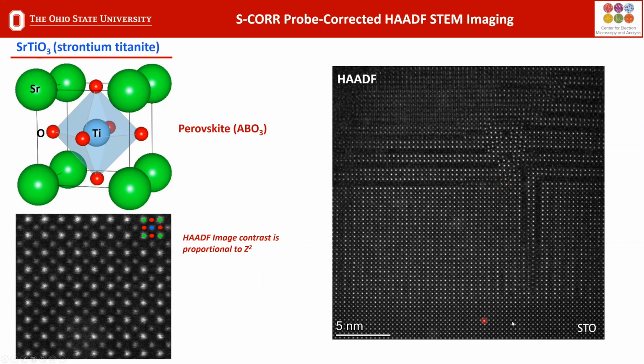So as a scientist, when you are growing these structures, you want to know what you've done. There are a lot of indirect methods that you can look at, and that's what they would do in their labs. But when you really want to directly see what's going on, you want to look and see the structure that you've grown. What we can see here, if we look along the green line, is that a deviation or a distortion occurs, right? We have these two black regions that form, and maybe an extra plane has been added.